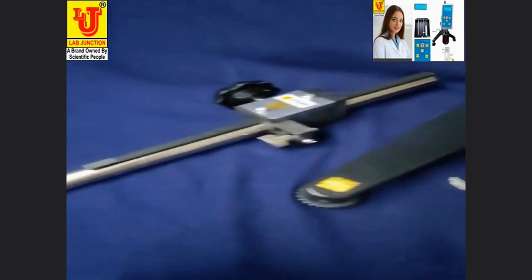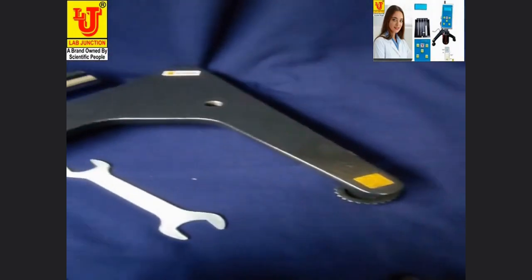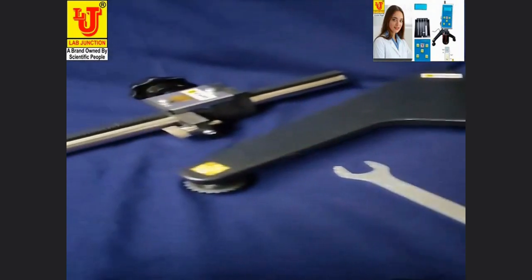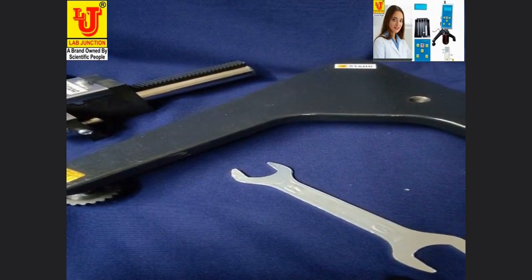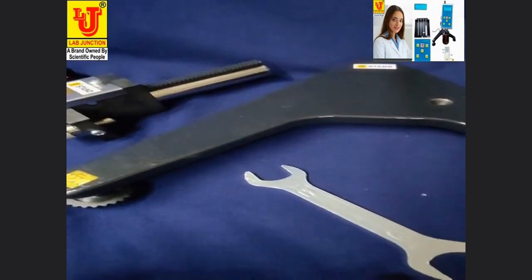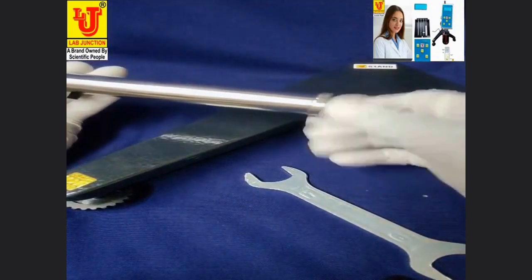Next, we have to install the standoff for the digital viscosity meter. Open this screw.